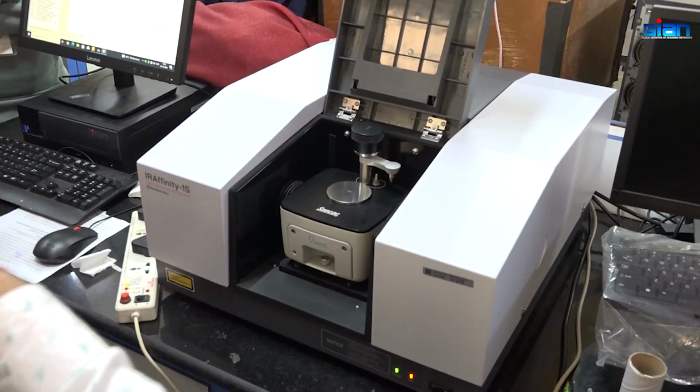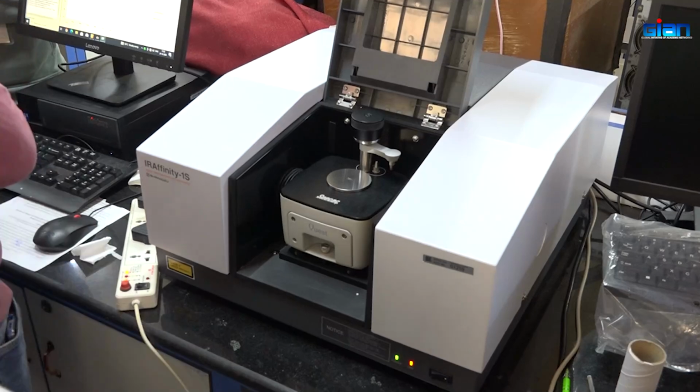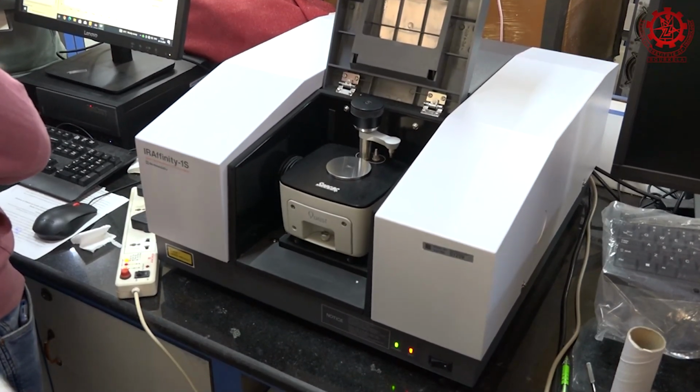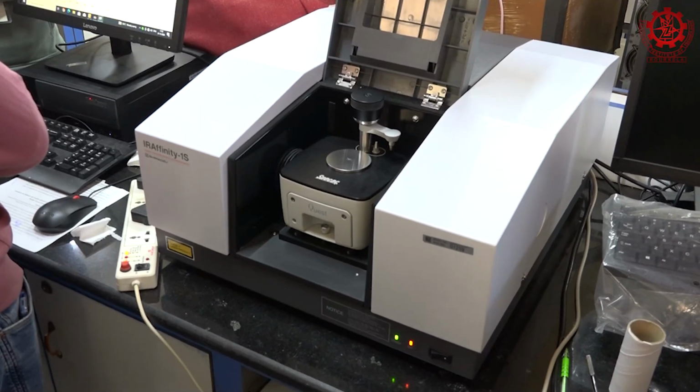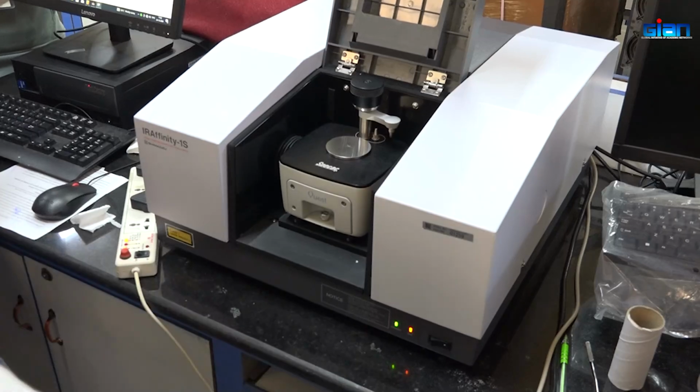So you can just go on with that one, but only if it is too high concentration, the peaks will not be sharp. But that can be experimented, that doesn't cost much. You can always do that one. So now you see what he did.